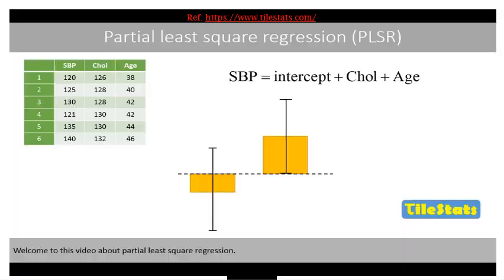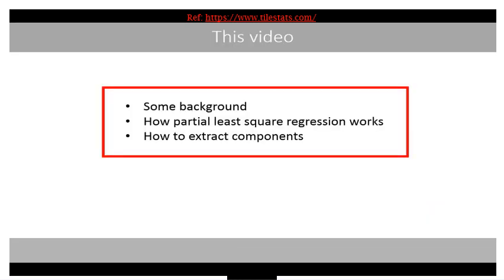Welcome to this video about partial least square regression. In this video I will give you some background to partial least square regression before we move on to see how the method works. At the end of this video we'll see how we can extract components when we use a larger dataset.